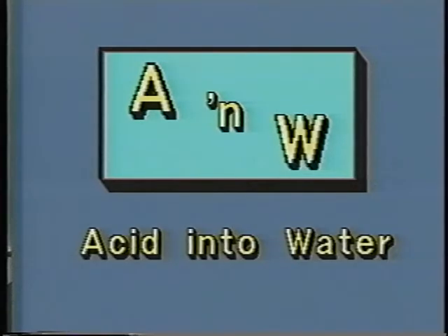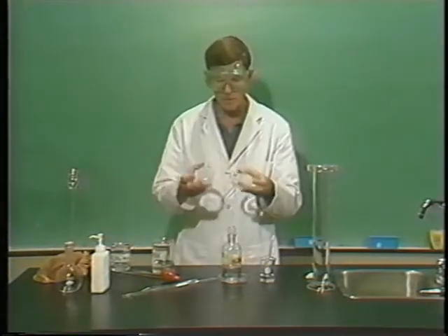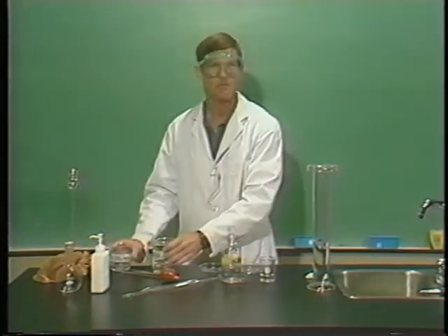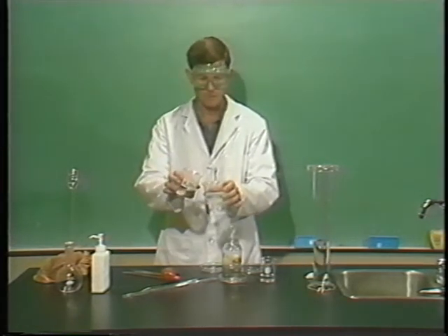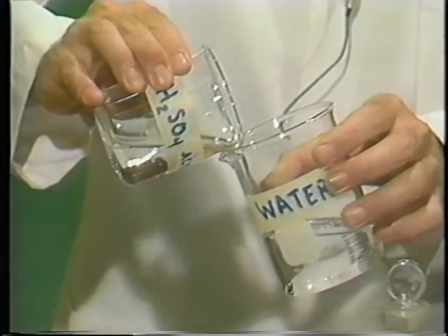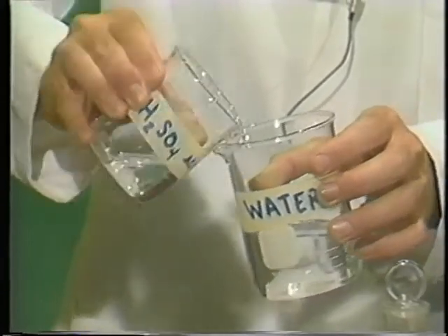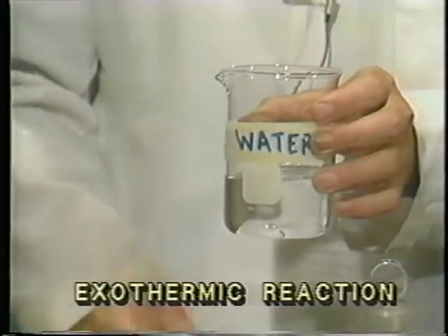Acid always goes in to water. A into W. So let's pour some right now. I'm going to use my Petri dish as a cover for the table, and I'm going to pour this sulfuric acid into this water. And note also that I pour it with extreme caution and very slowly, because this is an exothermic reaction. This mixture will heat up.